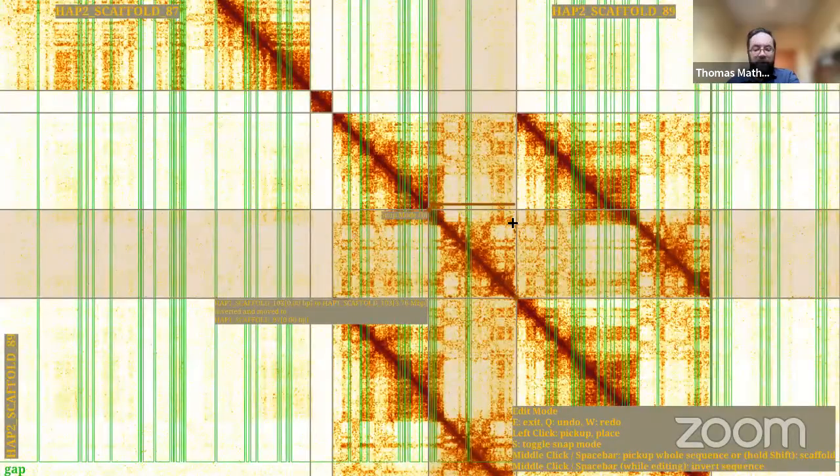Okay, so I did that in a slightly roundabout way. I'm sorry about that, but I'll just undo.